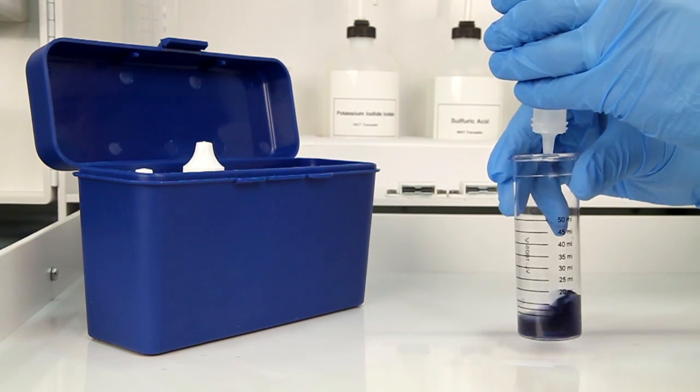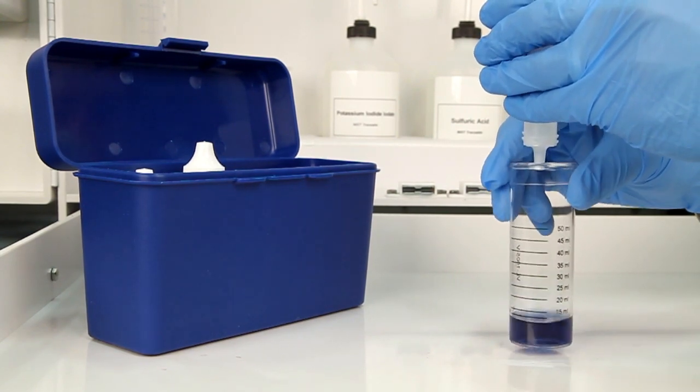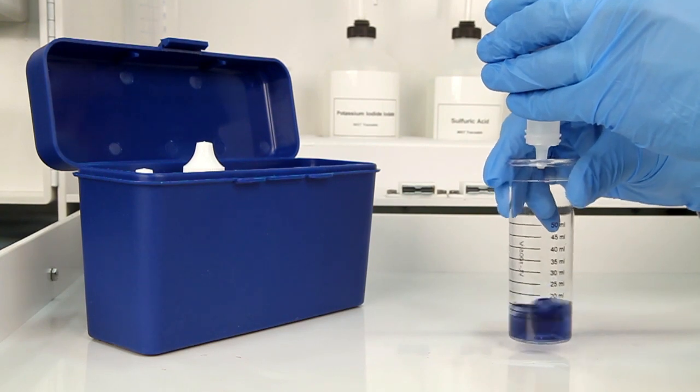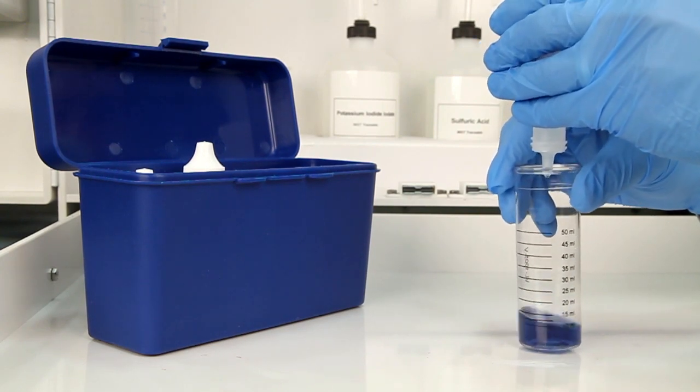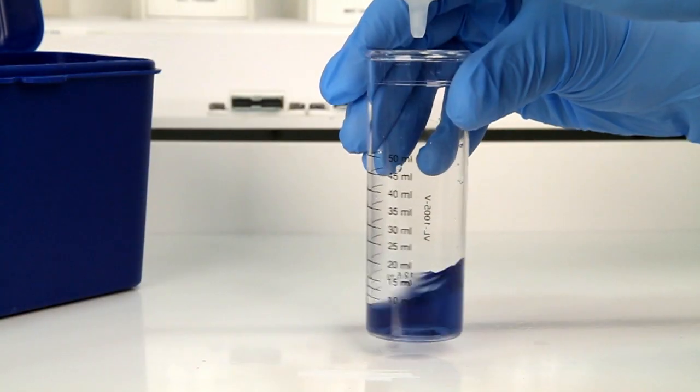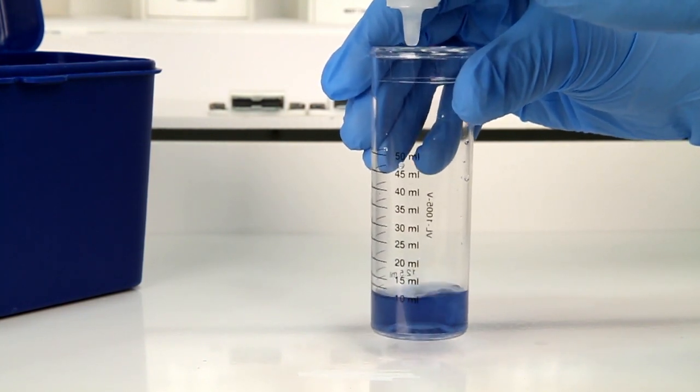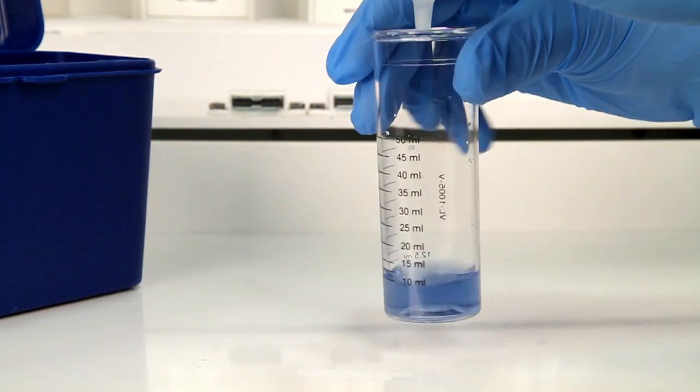Add the titrant one drop at a time, swirling the vial after each drop to properly mix the sample. You must count the number of drops during this step. The bottle contains a dropper tip, so it's important to hold the bottle vertically to get a consistent drop size.